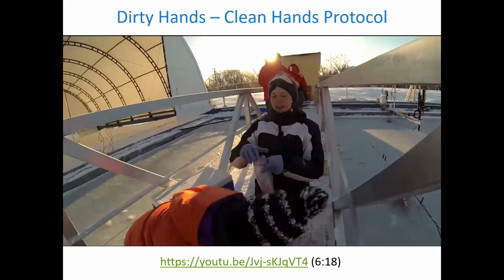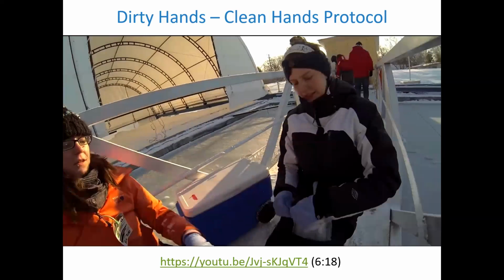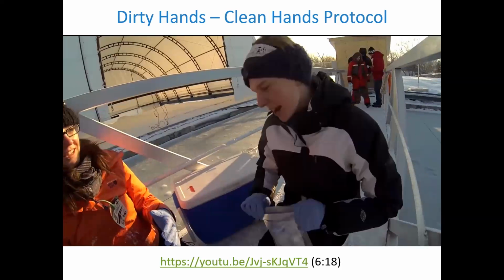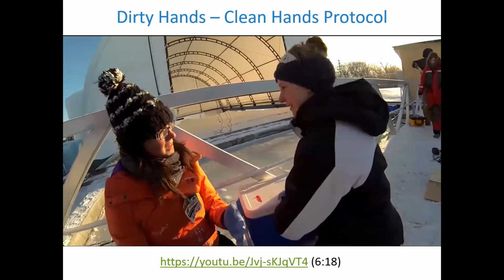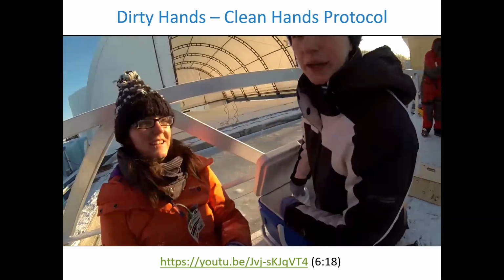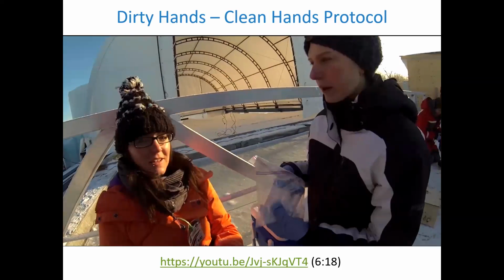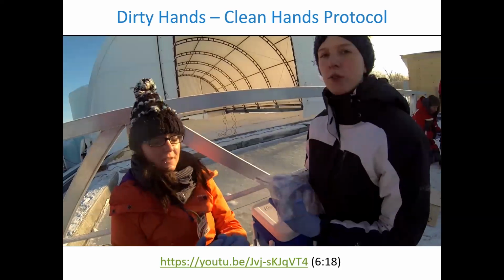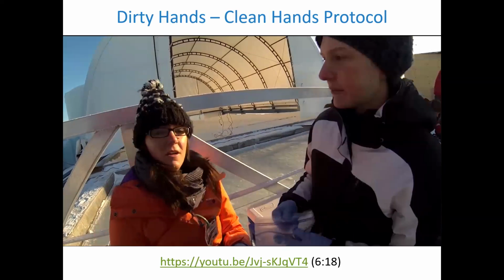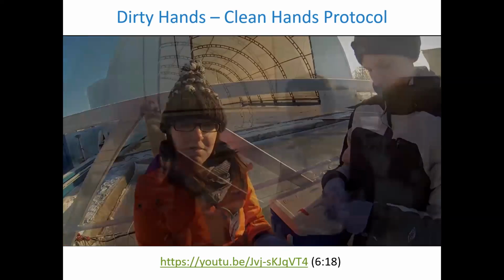As dirty hands, I want to make sure that I seal up the bags so that my samples don't pour and spill everywhere. Now, Sarah, are we done? Not yet, Amanda. What's left to do? Well, we haven't made sure that we're taking background levels of the outdoors. So that's what our field blanks are for. We want to make sure that there's no mercury coming out of the atmosphere that'll provide background levels for our samples. We also want to check that what we're doing is clean and we're not contaminating the samples ourselves.